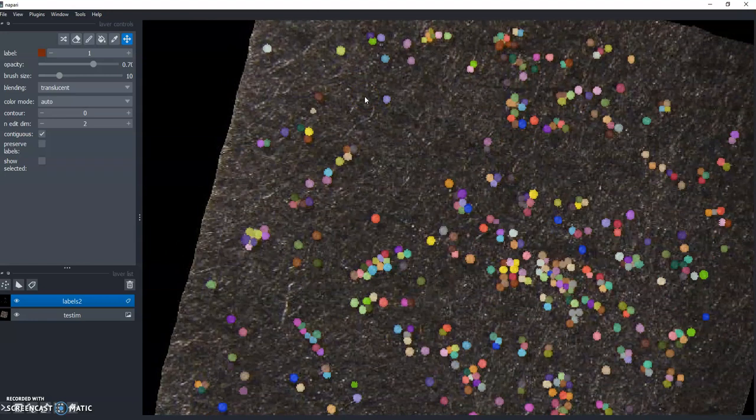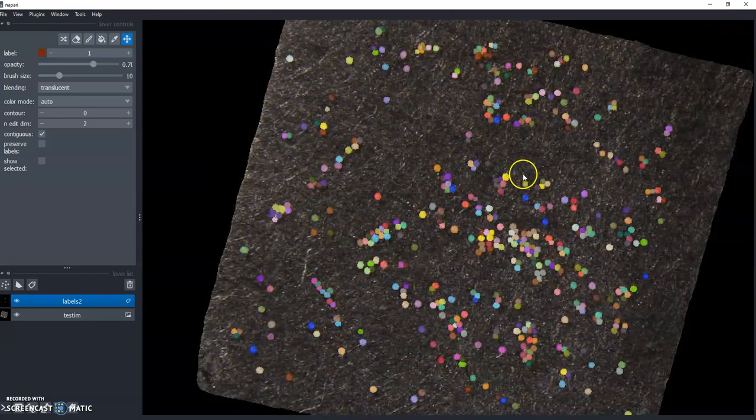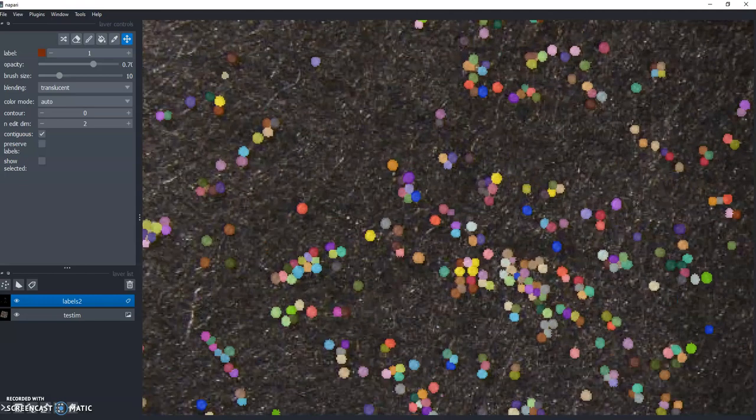So maybe if you have, I think the researcher said 100, maybe 200, maybe more images, it would help to re-annotate 5 or so, and then test it on another batch of 5 and see if retraining the model helps with some of the mistakes. And again, I use StarDist, but no reason you couldn't retrain a Cellpose model.